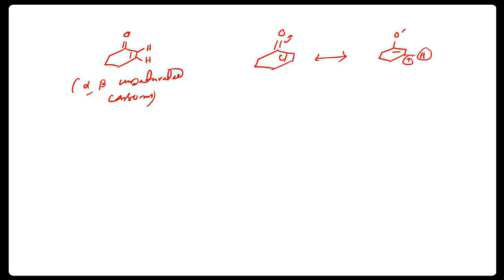Look at these protons. This is attached to an electron deficient carbon. So this proton will have a highly electron deficient environment. And look at its ppm value. It appears around 7 ppm.